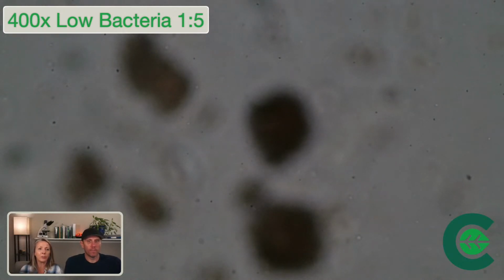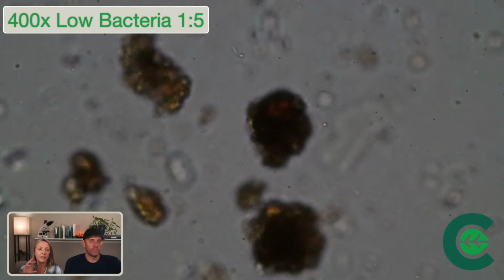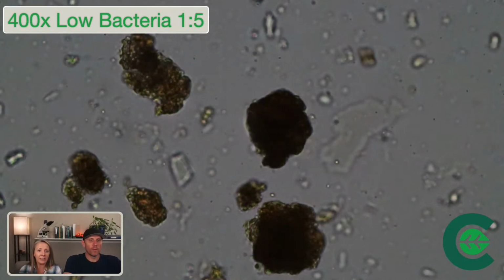So I'm just going through the top of the sample down to the bottom of the sample, showing you how we move through a slide to really get an idea of what's going on.